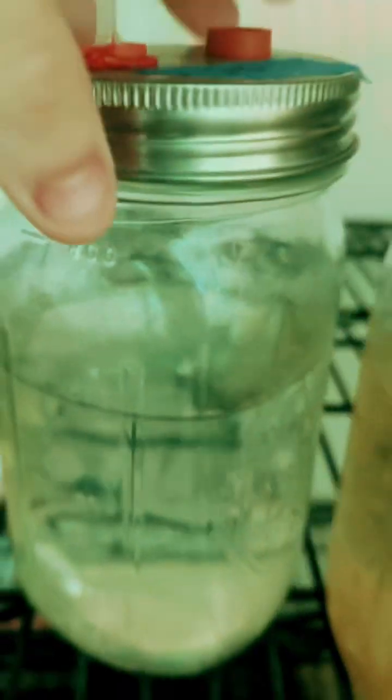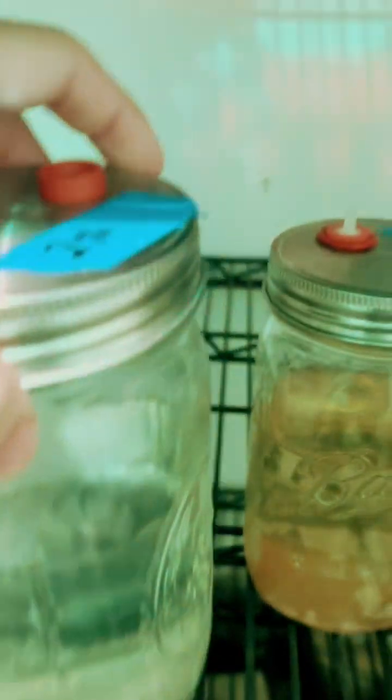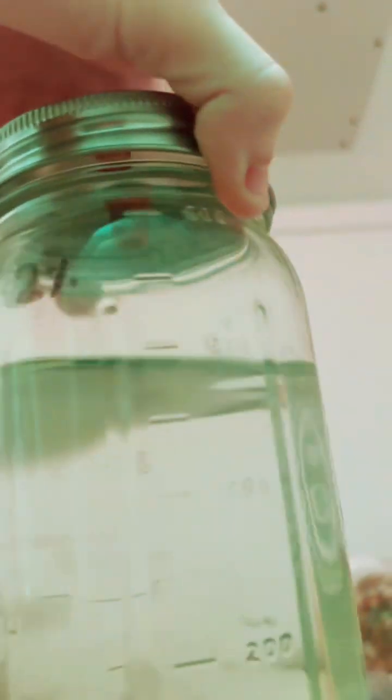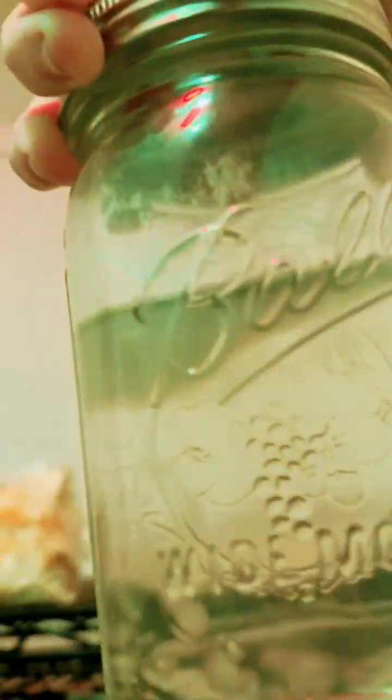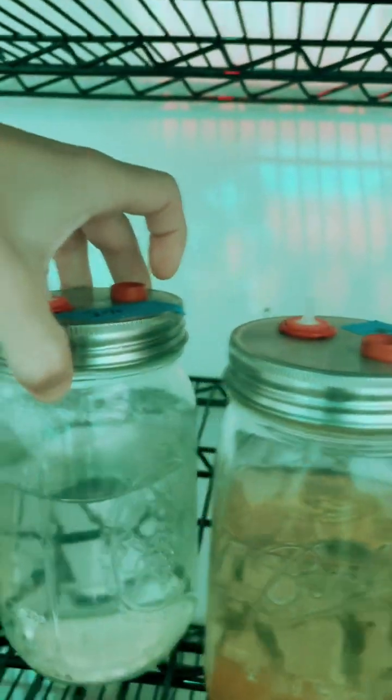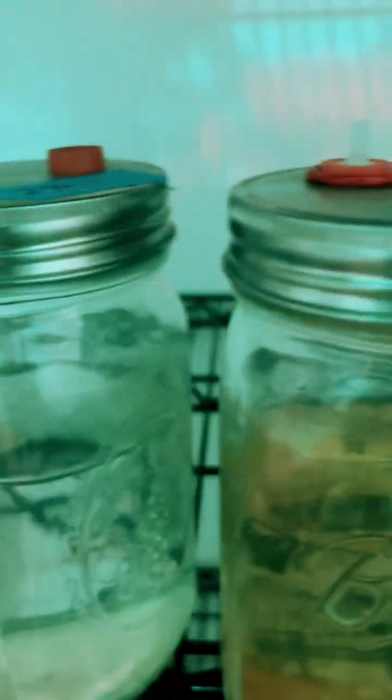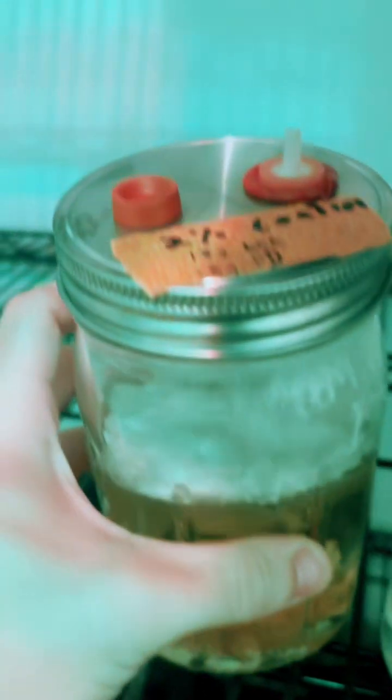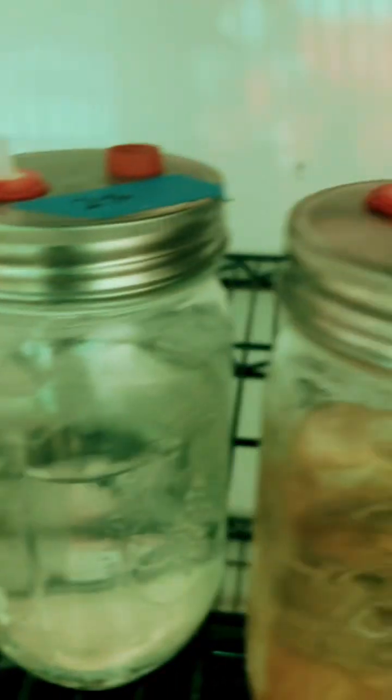Up there on the top, see if I can get it into light or something, but it's growing. It's just not growing quite as well as the mix over here on the left that the company uses right now.